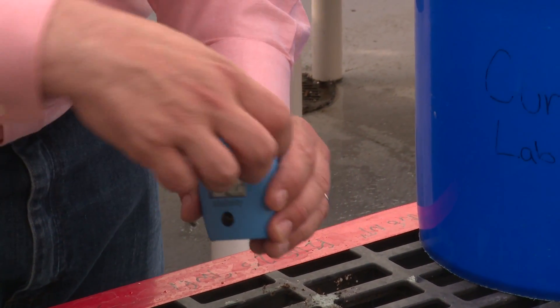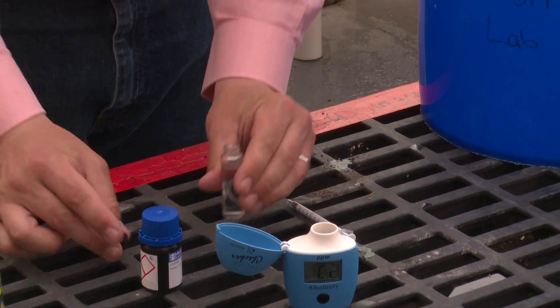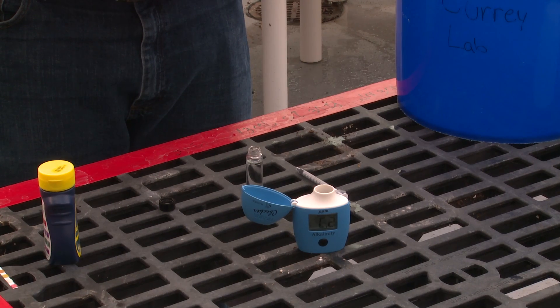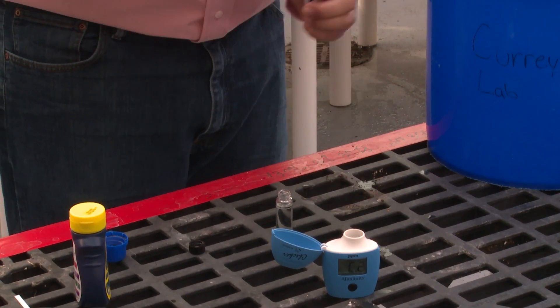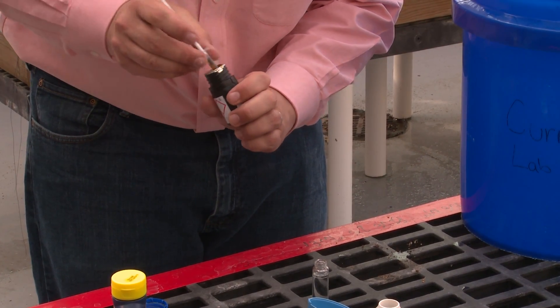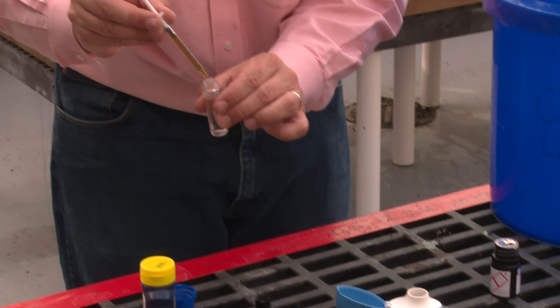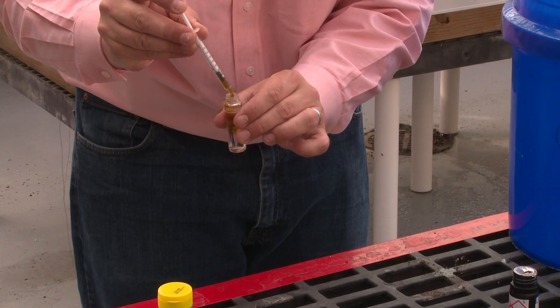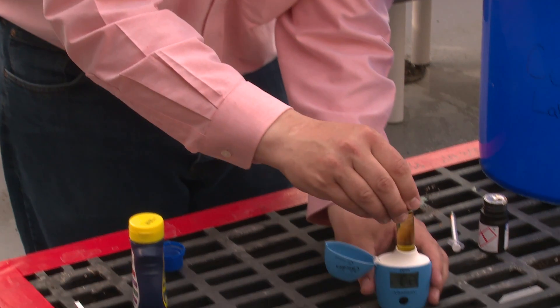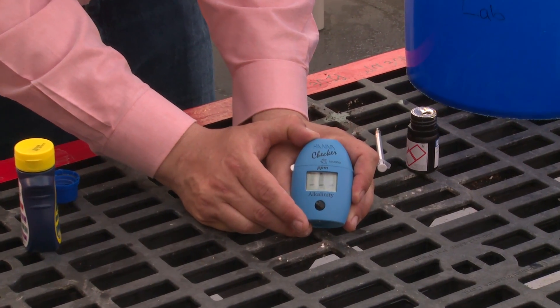Once it's blinking again, it's ready for the next step. Open it up, remove your sample, take the cap off the sample, and add one milliliter of our reagent, which is going to make a colorimetric determination of alkalinity. We take our syringe that's provided with the kit and draw one milliliter of the reagent, adding this to our sample. Place the cap back on, place it in the meter, close the lid, and hit the button again. Now it's going to determine our alkalinity.